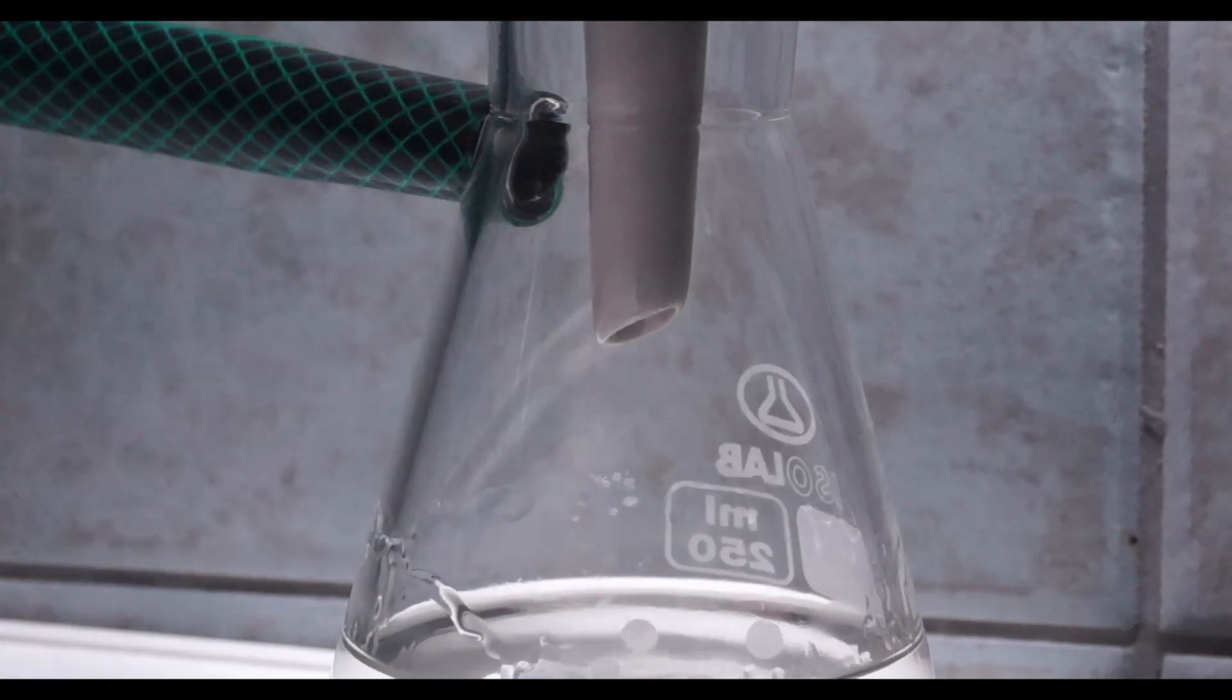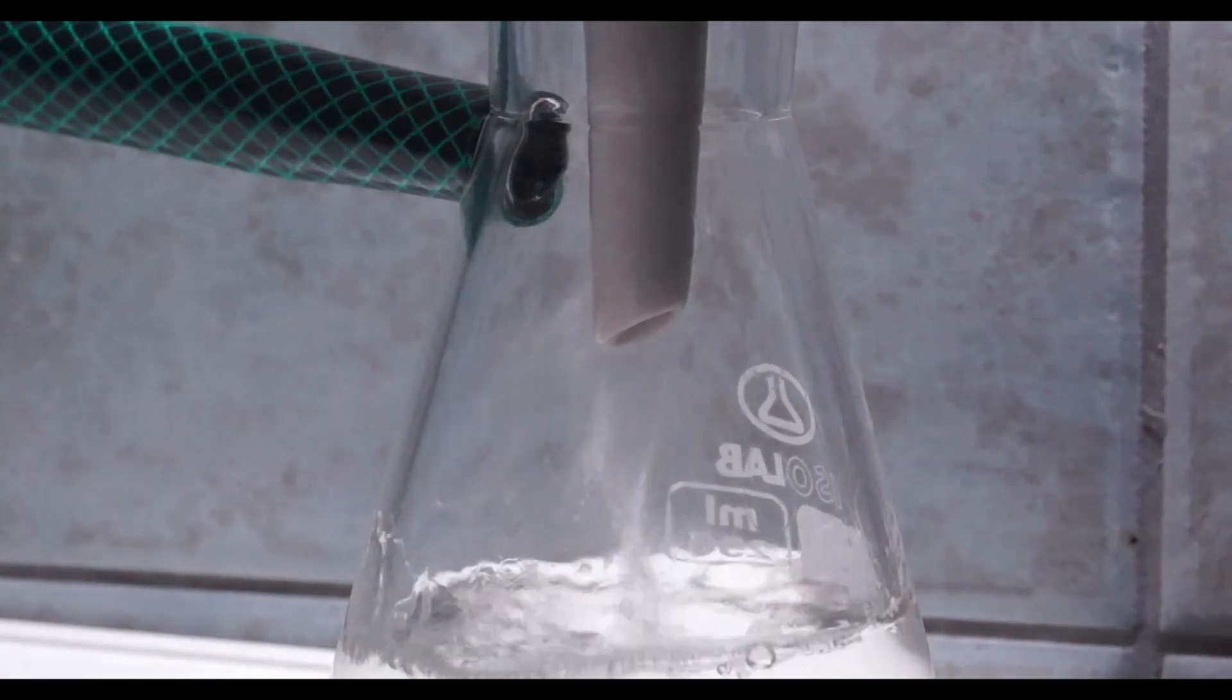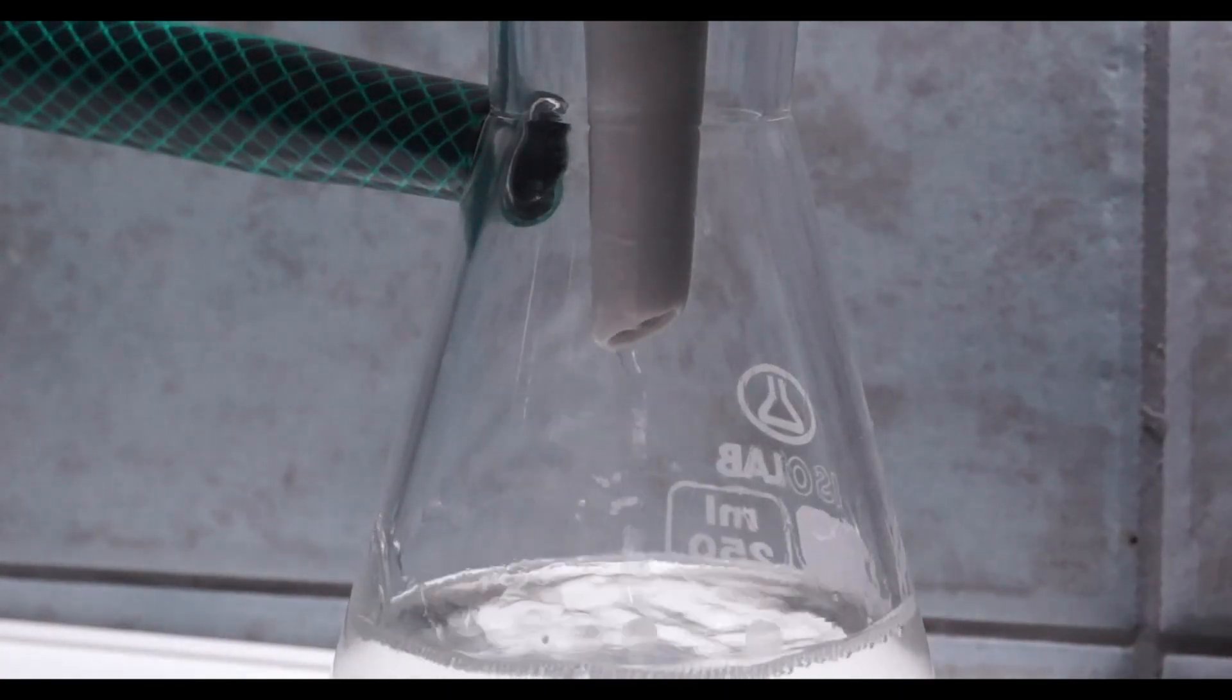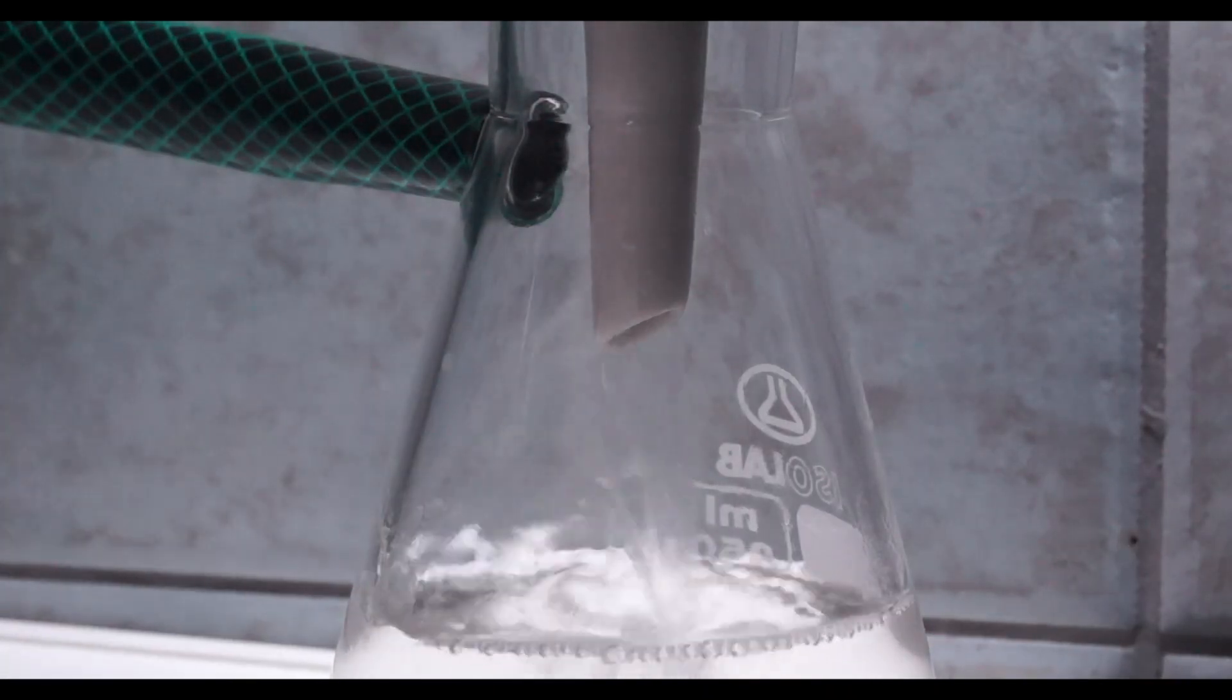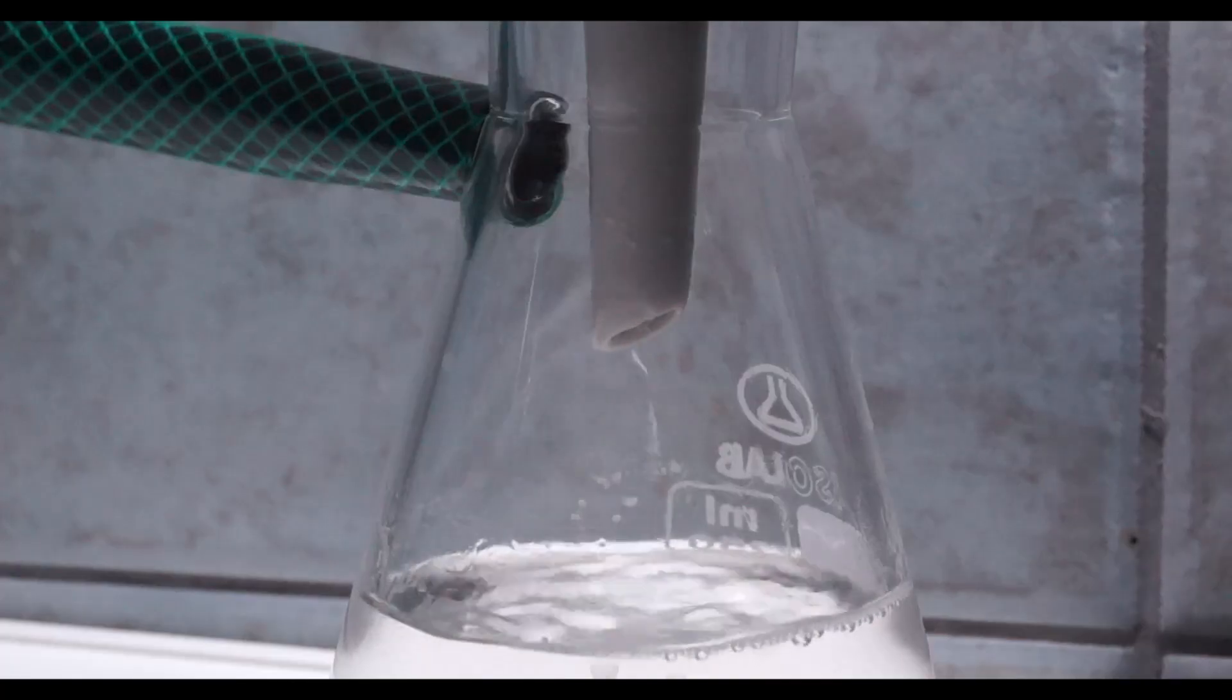I washed the beaker and the solids in the Buckner funnel with another 50ml of fresh hot acetone. The paracetamol that I want is dissolved in the filtrate and as you can see the product began to crystallize in the vacuum flask.